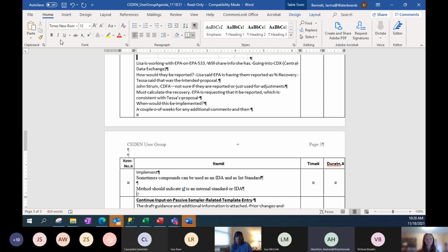So some of those analytes don't have that quantitation correction, and they'll use the labeled analyte as a traditional internal standard, and not an IDA, but it would still be reported as an IDA because there is an analyte within that analyte list that they are using it for as an IDA. So you're right, it has a dual function in that sense, but you'll be able to determine that in the database because as an IDA, it can only be used in that way if it's a direct analog to the analyte of interest.